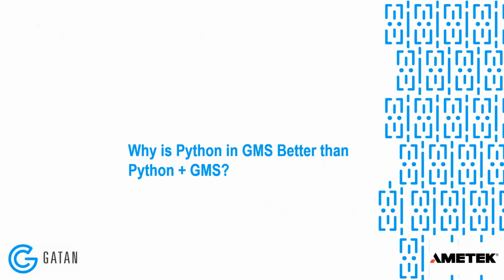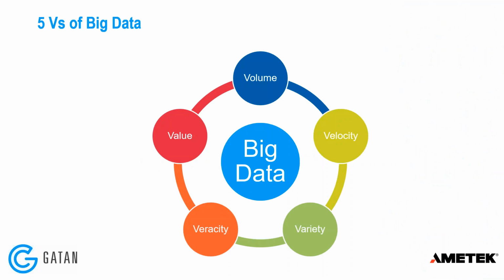So the primary question that I want to address in this webinar is this one: why use Python within GMS? Why would that be better than just using GMS to collect the data and then using Python afterwards? And I have a number of reasons that I want to talk about.